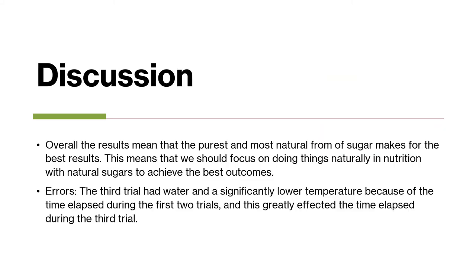Overall, the results mean that the purest and most natural form of sugar produces the best results. I think this means that doing things naturally — using natural sugars in nutrition, baking, etc. — is going to get you the best outcome. The error in the third trial, where the water was at a lower temperature due to time elapsed during the first two trials, affected how long it took for the balloons to stand up and the reaction with the yeast.